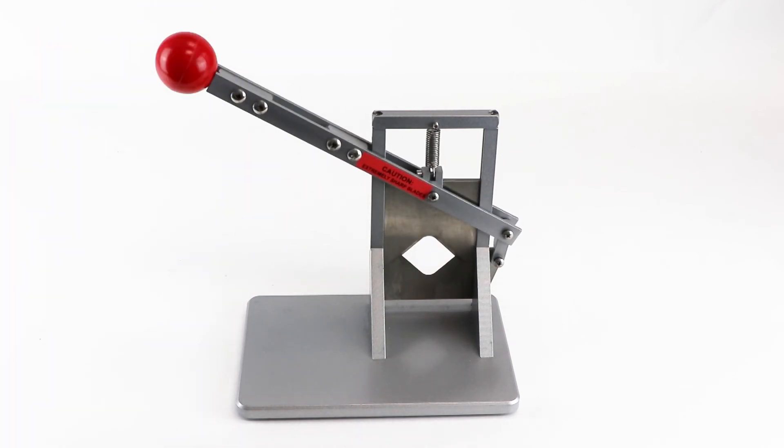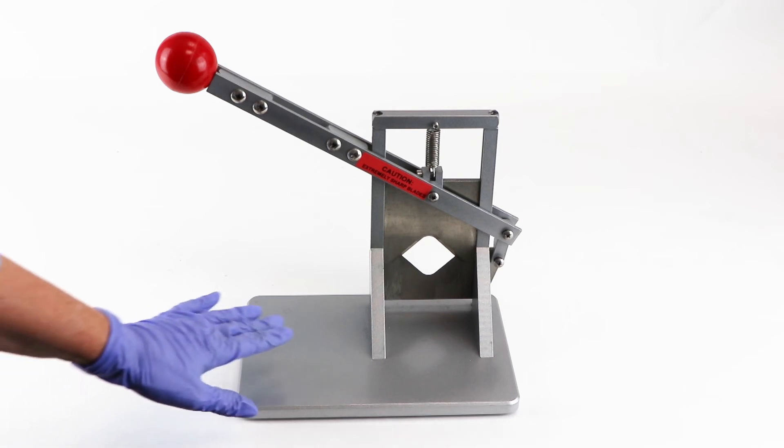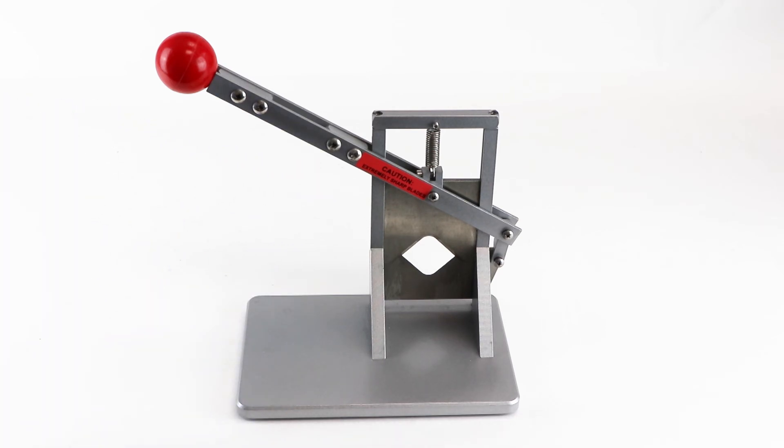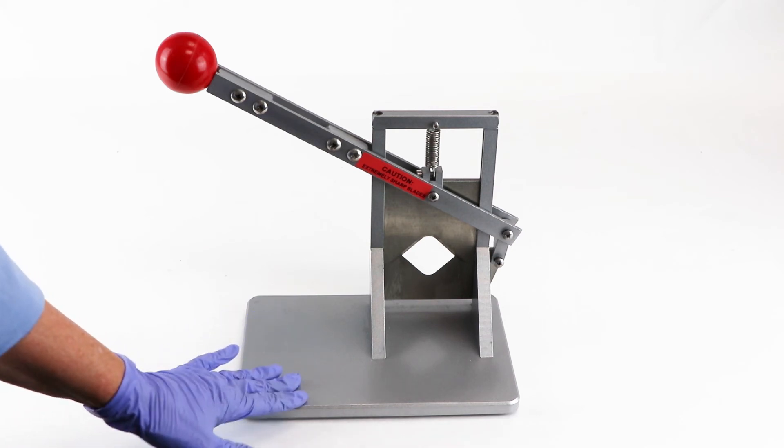The large base affords greater stability and the long handle provides extra leverage. The spring action prevents the blade from falling unexpectedly. The hardened stainless steel blades ensure longevity of the unit, and the fluoropolymer coating on the surface of the base makes cleanup easy.